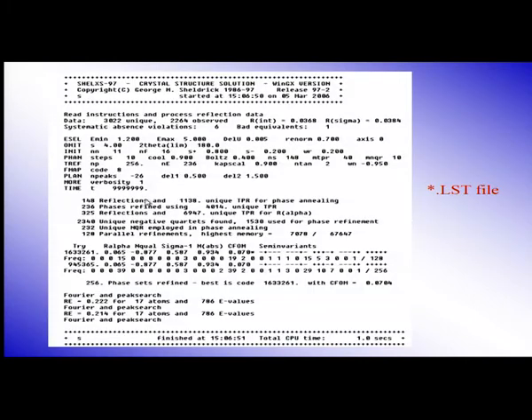So, now I ran a program, SHELXS 97. 97 is the year in which it was released. So, this is a crystal structure solution. These programs are packed in a suite called WinGX. WinGX, all the crystallography programs needed are distributed freely, and we can get it. And this is a copyright SHELXS program, first written and released in 1986. Now, it prints out whatever you have given as instruction.